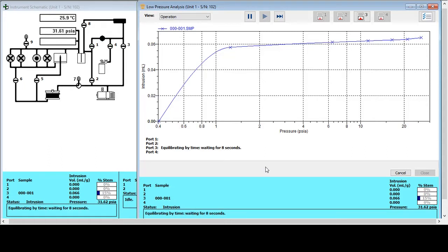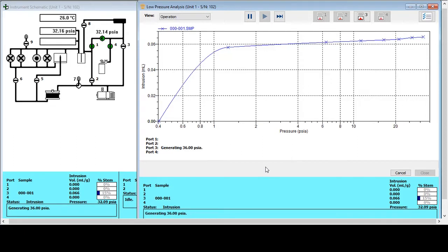So we're going to allow the low pressure analysis to continue up to 50 PSIA. And the next stage will be back onto the autoport itself to remove the penetrometer from the low pressure side of things and then insert it into the high pressure port.